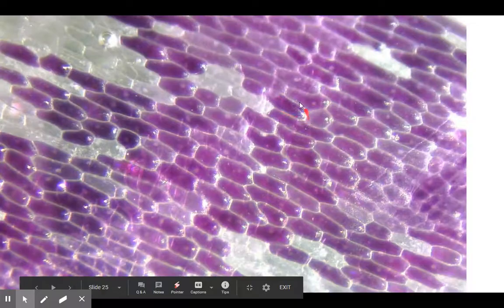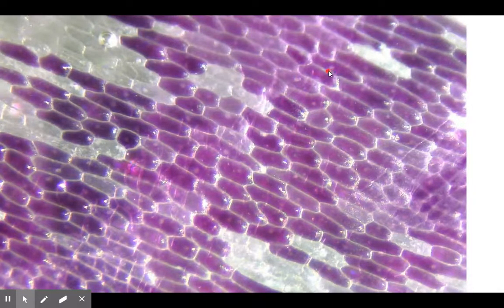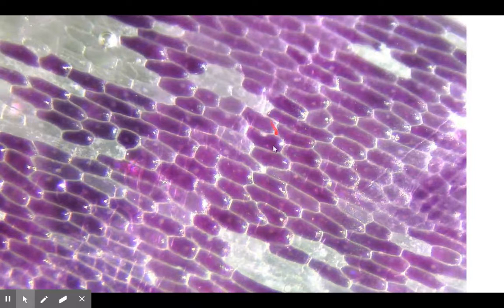Here we can see the purple pigment of the cell. Each one of these small circles is actually the nucleus. There was no stain added to this, so you get what you get. Some of them we can see the nucleus, some of them we can't. You can see it in a lot of them. Then you see this white shadow—it almost looks like a space in between the cells.